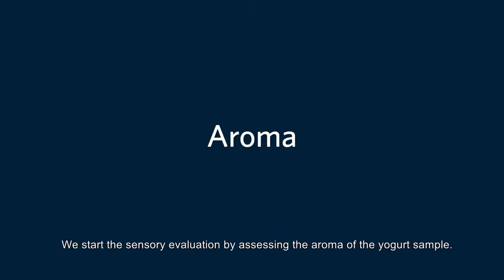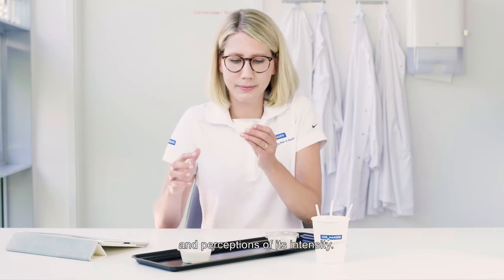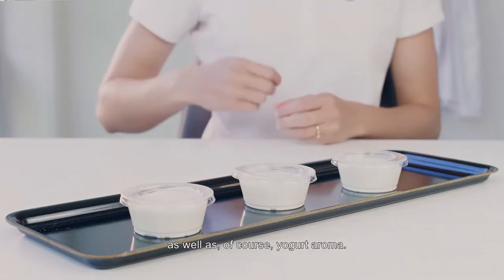We start the sensory evaluation by assessing the aroma of the yogurt sample. The cultures used in the yogurt affect the aroma and perceptions of its intensity. Common examples include buttery and creamy aromas, as well as, of course, yogurt aroma.